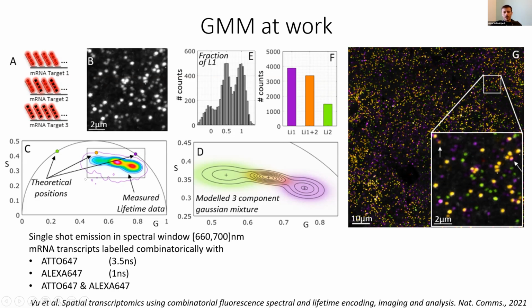Obviously, you have a bunch of other fluorescent components in your sample. I mean, our biology is fluorescence. Nearly everything is fluorescent in the molecular scale. So you have a bunch of components here that are pulling your data elsewhere, but you still see the 3 main groups, which are what you expected to see. Attempt to cluster automatically, you obtain 3 clusters, and then you go back to the original space, and there you have it, the 3 genes separated. Still, you have some areas of uncertainty, as we showed before, which would correspond to the regions in between.